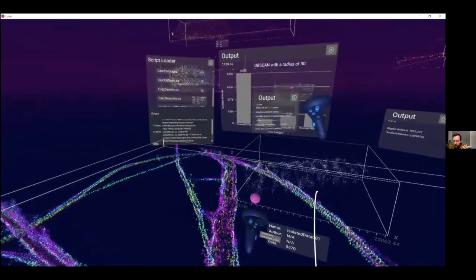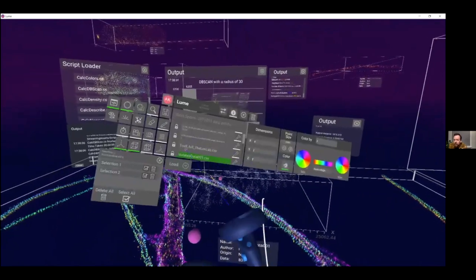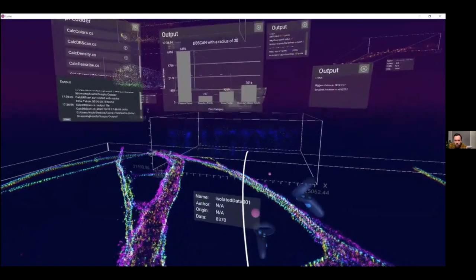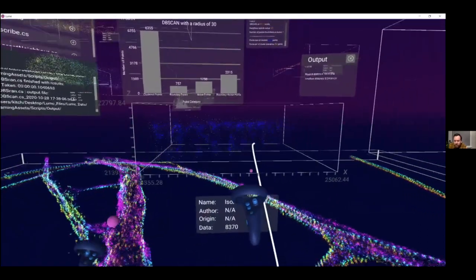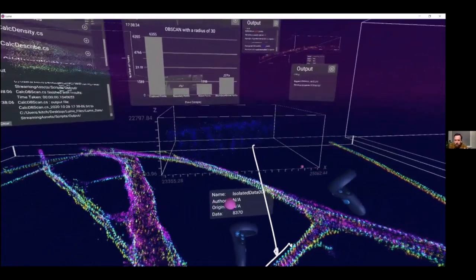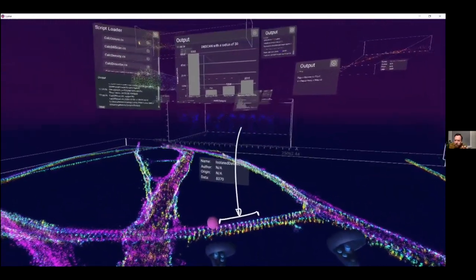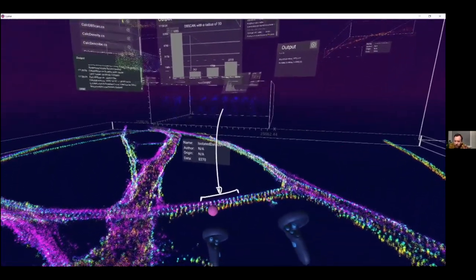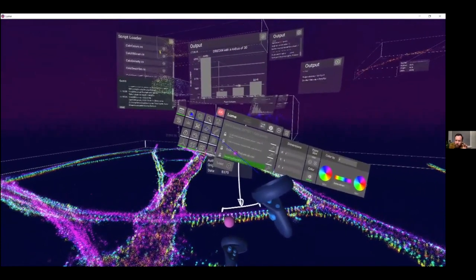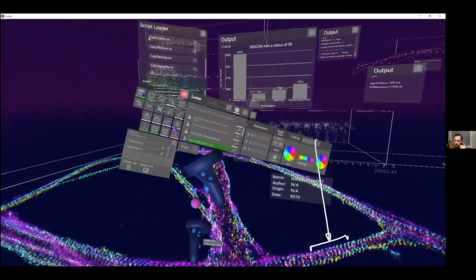First off, there's a variety of things. One of them, it allows you to examine the data to make sure it's of high quality. It allows you to segment specific areas of that data and perform quantitative analysis on various areas of it to make sure that one area is similar quality to a different area. And also, what we've really found, more importantly, is it's really allowed us just to communicate our discoveries back to our collaborators and to other people in quite a timely and efficient manner.